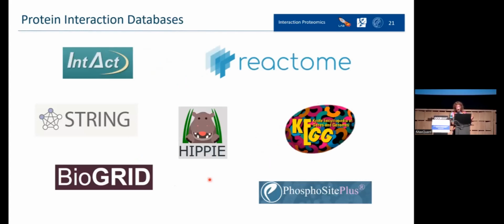But what I showed you before was specific to that experiment. They calculated networks using that experiment, but you cannot always create a specific experiment. If you want to study interactions between proteins, you have neither the time nor the money to check every single protein you're interested in to see what it interacts with. As you can see, it's also quite difficult to be sure about which are the interactors of a protein, and you have to prepare a really time-consuming experiment like the one that I showed you before.